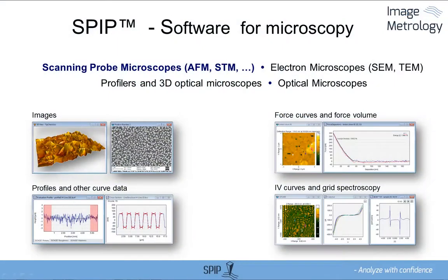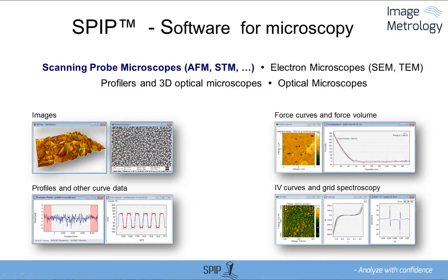SPIP is a software package dedicated for analyzing SPM data. SPIP is also a great tool for analyzing data from profilers and electron microscopes. In the following we'll focus on some of the basic features interesting from an SPM user point of view.